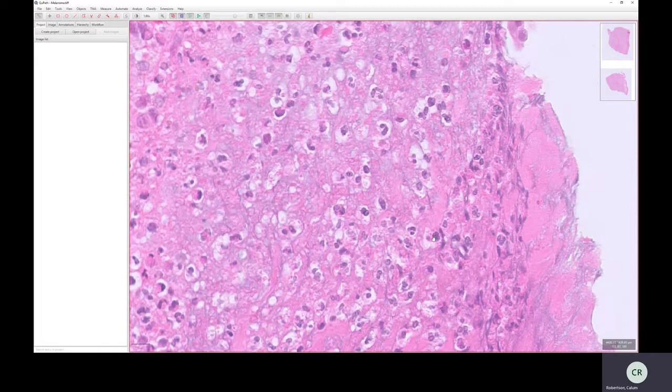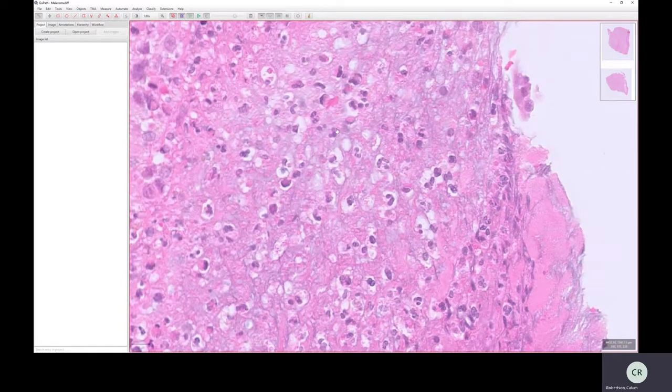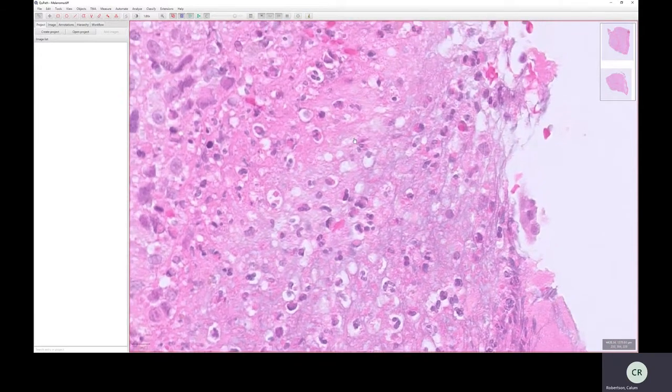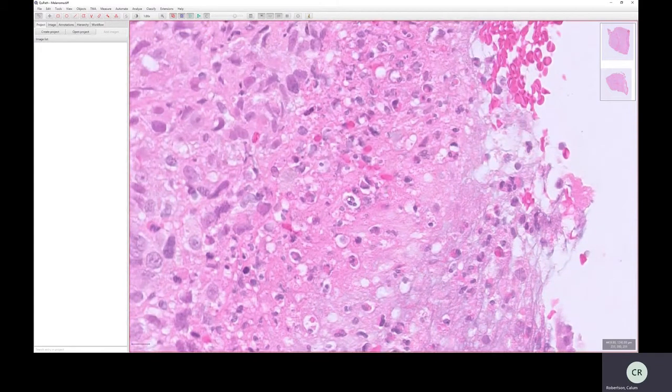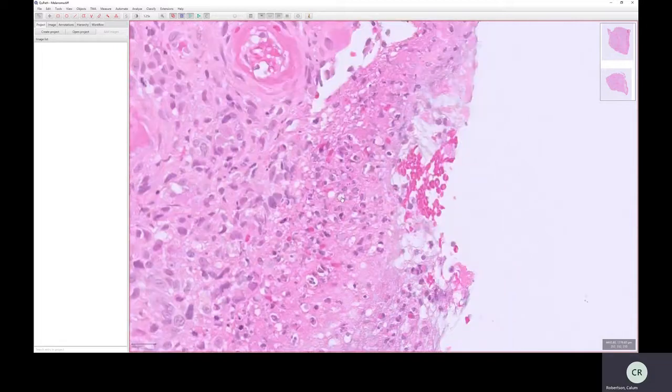And we've got a bit of pink cytoplasm round about it. And here's another one. This is a really good Mickey Mouse looking one, actually. 1, 2, 3 lobes, and that's what neutrophils look like. So these are all neutrophils. So this is another example. We've got a bit of pink cytoplasm, and 1, 2, 3 lobes of nucleus. So these are all, or a lot of these cells are neutrophils.